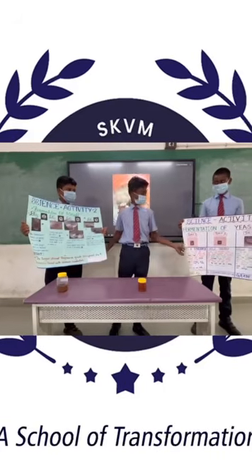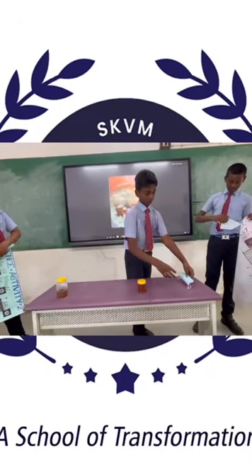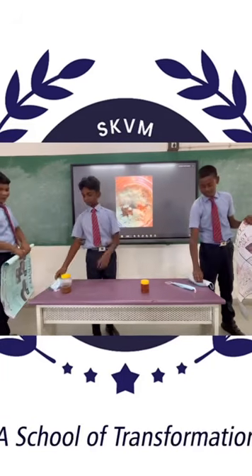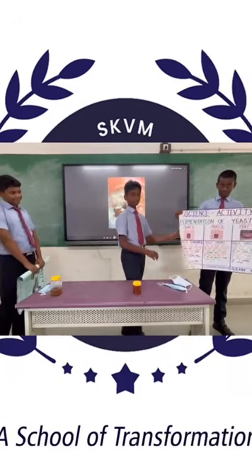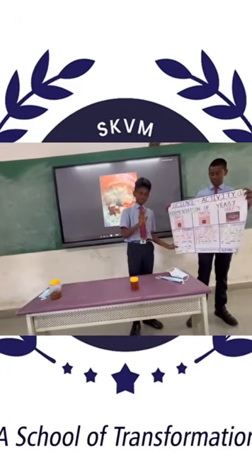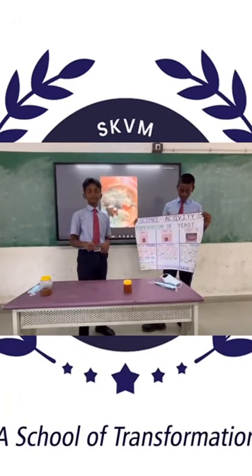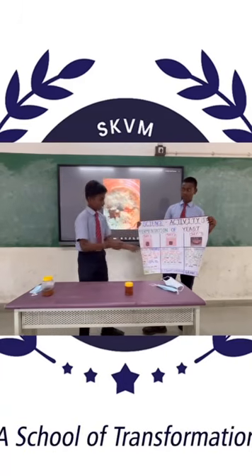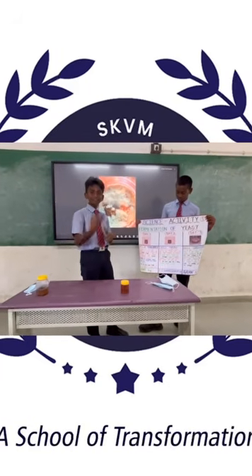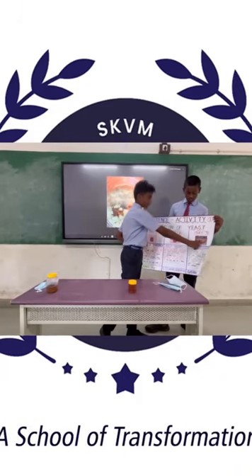Next we come to the fermentation of yeast. How it is formed is also the same process. Take a beaker and add 150 ml of tamarind water, and then add sugar. Why do we add the sugar? Because we want to feed the yeast. Then only it will form, multiply the cells, and give us a bubble-like structure.